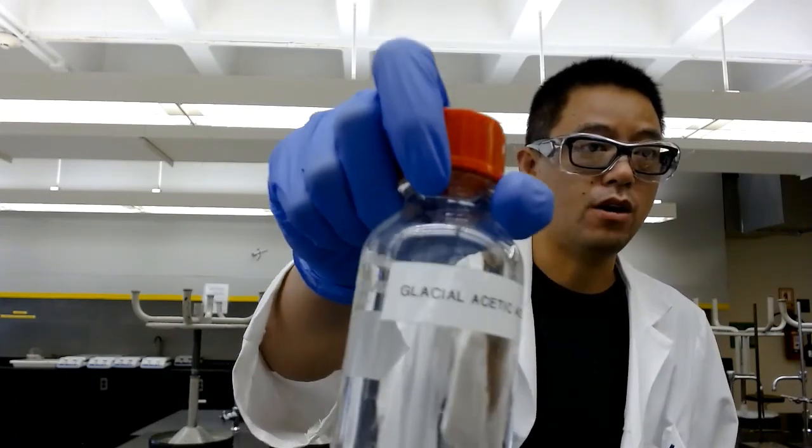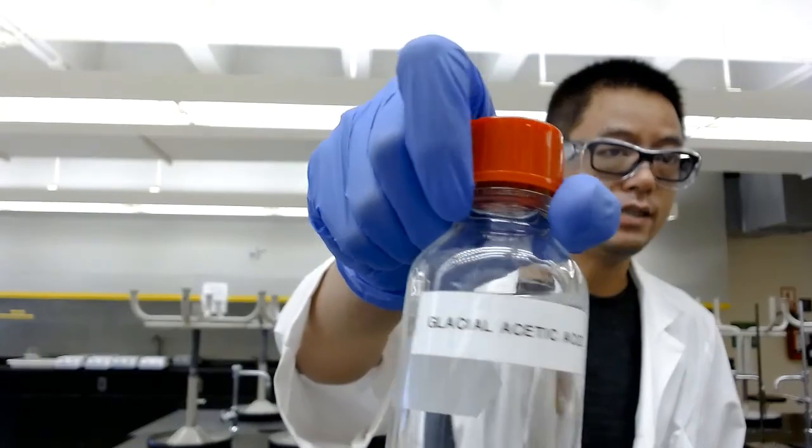Now if we look at the procedure, step number 1 is making a stock solution of acetic acid in water. We need 1 ml of acetic acid. I have a bottle of glacial acetic acid. We need 1 ml of it, and 59 ml of water, and then mix them together. Then we're making a stock solution. Let's just get started.